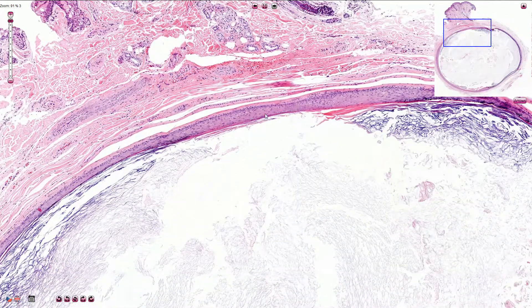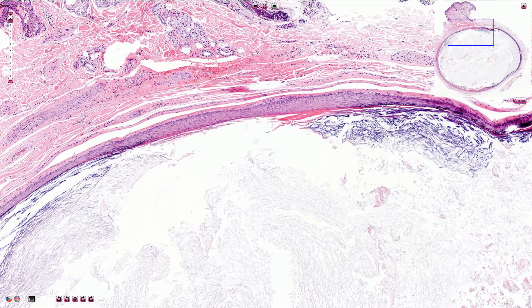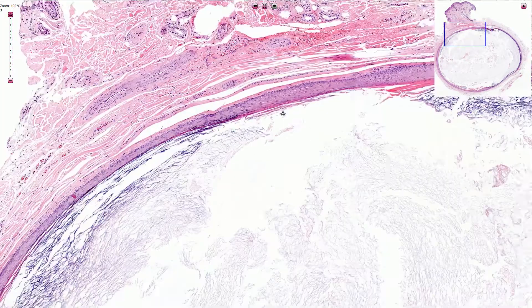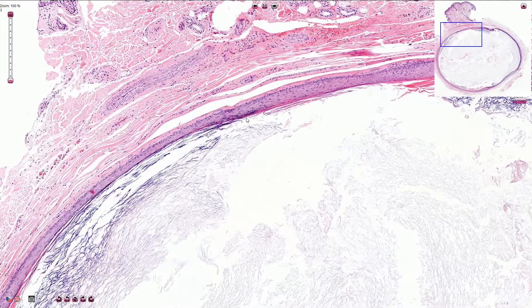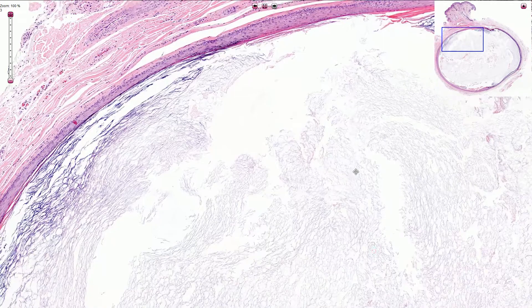Normal stratum granulosum is present, as we can see here. The cyst contains laminated keratin material.